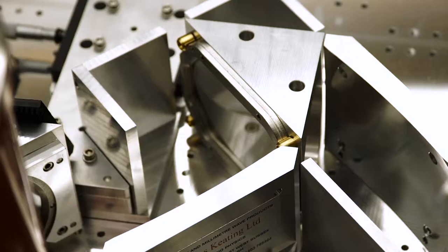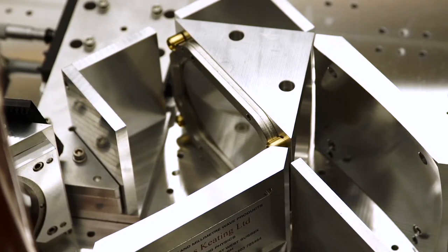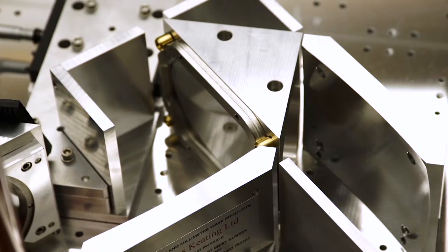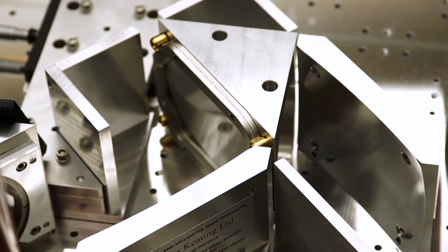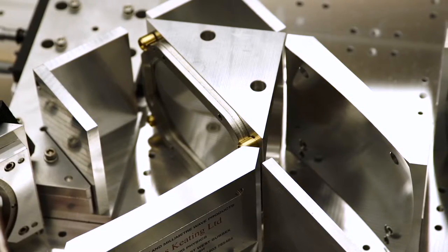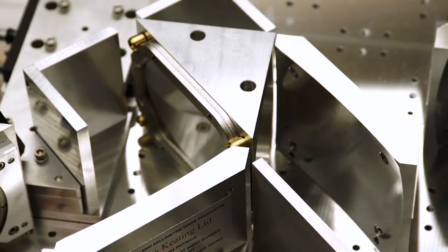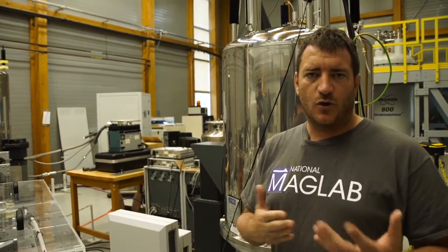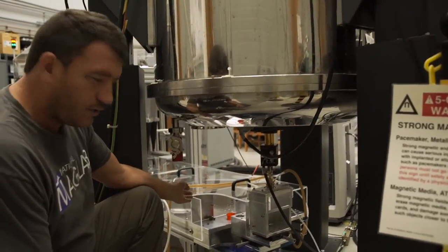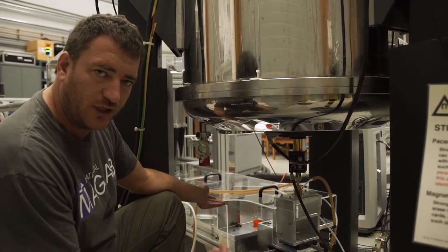This acts as a Gaussian beam shape filter going into the corrugated waveguide inside the probe. Before we get to the probe we have an interferometer, which is used to change the polarization. We start with a linearly polarized microwave beam, which we can change to vertically, horizontally, or circularly polarized. In our case we set up the interferometer for circularly polarized microwaves, because only half of the microwave power actually polarizes the electron spins — so we might as well send only the part that does.